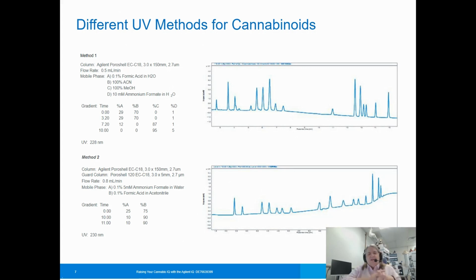So let's take a look at some different methods for cannabis. This is actually a poster that we did for ASMS. My colleague Brian Whiteley has an excellent method that he's developed on the C18. Again, separation, right? The holy grail: baseline resolution in the shortest time and cost effective.